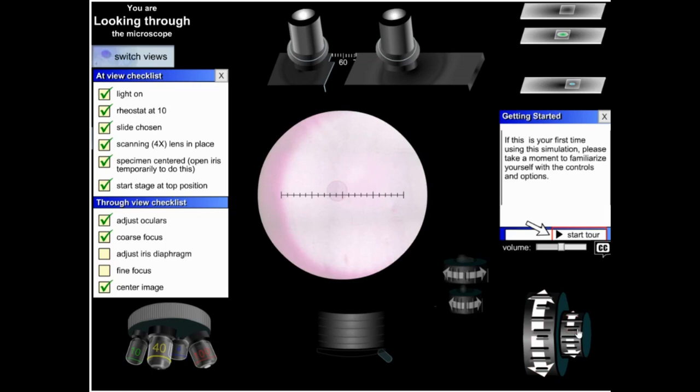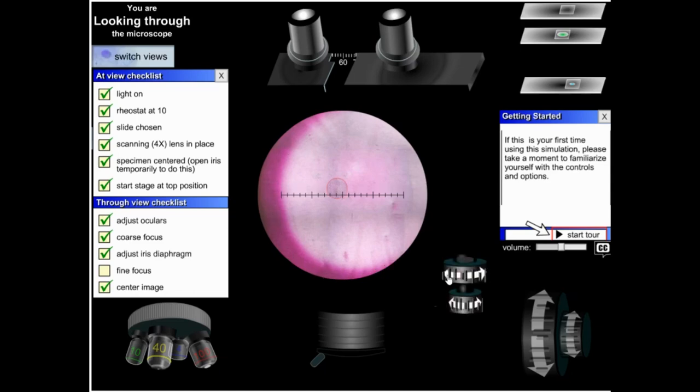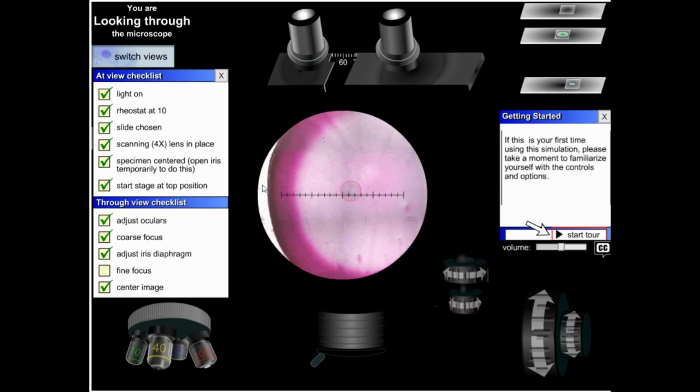So here's the first thing you see. And when students start looking at this, they tend to think that this big thing here is the image they're looking for. No, no, no. That's just the edge of your stain. Let me show you. That's where the color is most intense. And what you really want is to look somewhere in here or so. Those little dots that you can barely see, those are the dots you want.